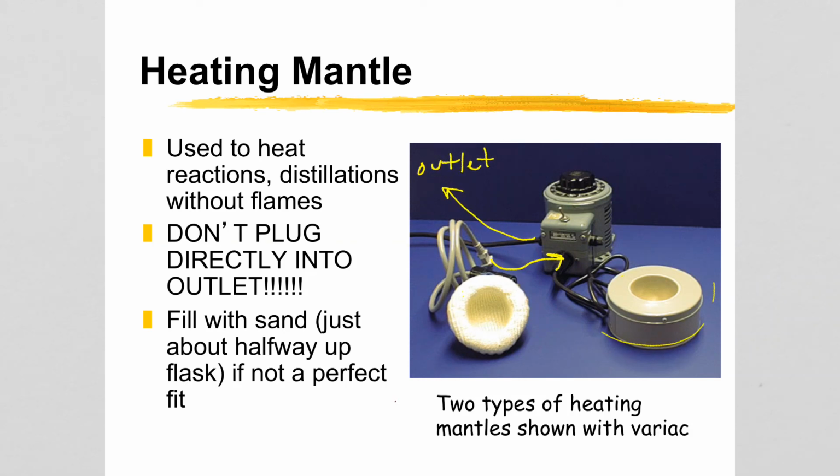Lastly, as they said in the video, if your heating mantle is not a perfect fit for your flask, you can fill it with some sand to help transfer heat.